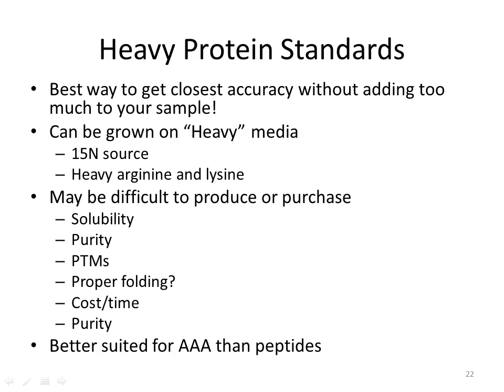And the question is, once you have the heavy protein, how do you ensure it is the exact same sequence as your light protein? So you have to do first experiments to combine them and see if you're seeing the exact same peptides. If you have sequence variants, you have to figure that out. So it does take time to do some characterization of that.